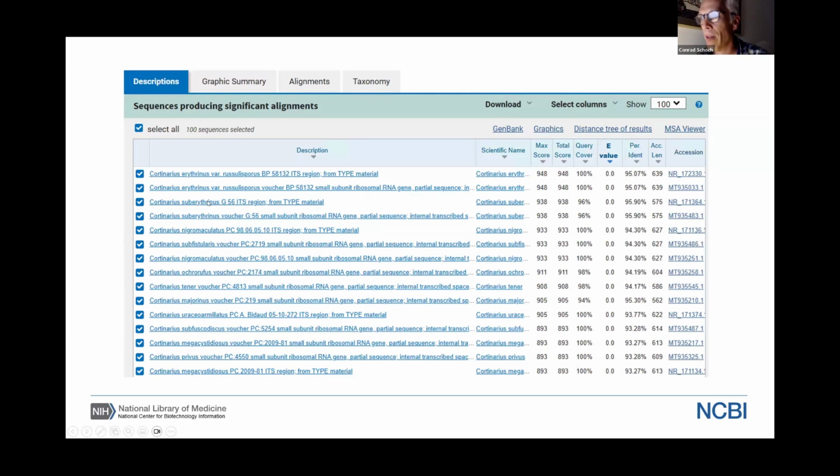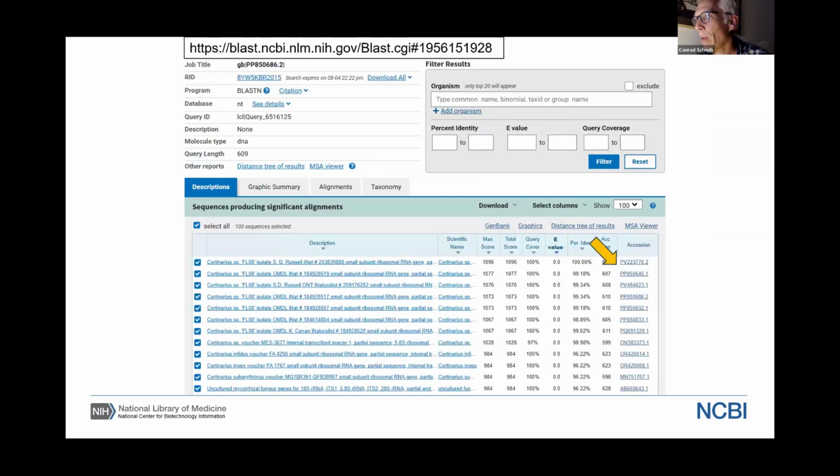So species, there's also varieties here, but there's mainly species. They all start at a percentage identity of 96% and going lower. So again, this sort of confirms what I've seen before. So I don't think this is going to yield anything more than what we've produced with the regular BLAST. So let's go back to our original BLAST output.